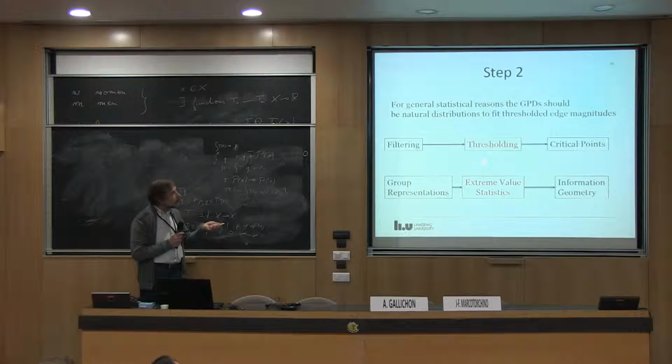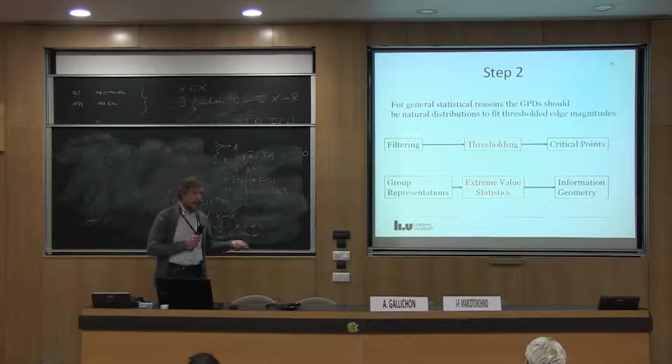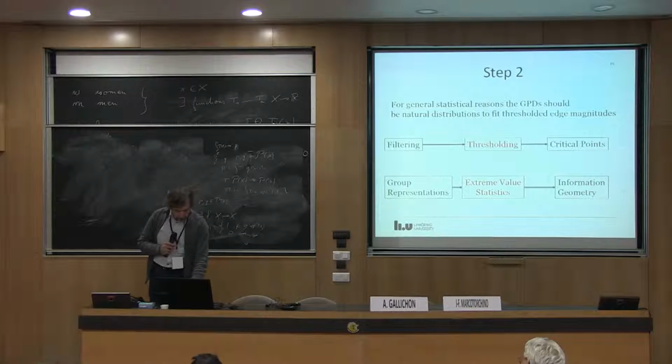And so you only look at very high values over the threshold. So it's also more efficient computationally, because you can concentrate on the very important things here.